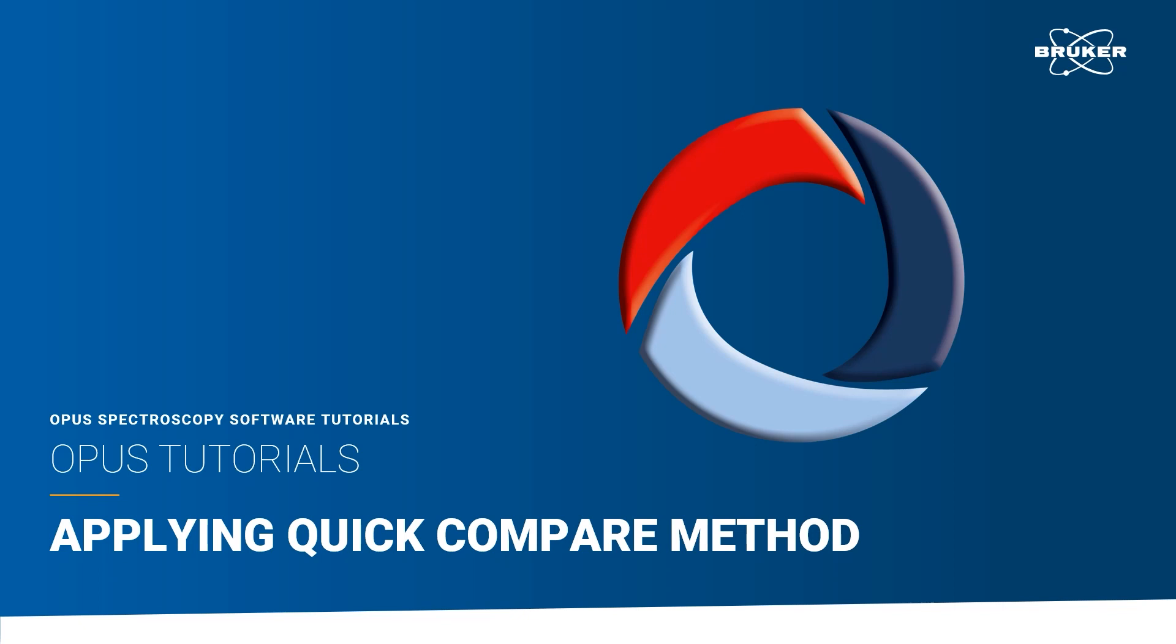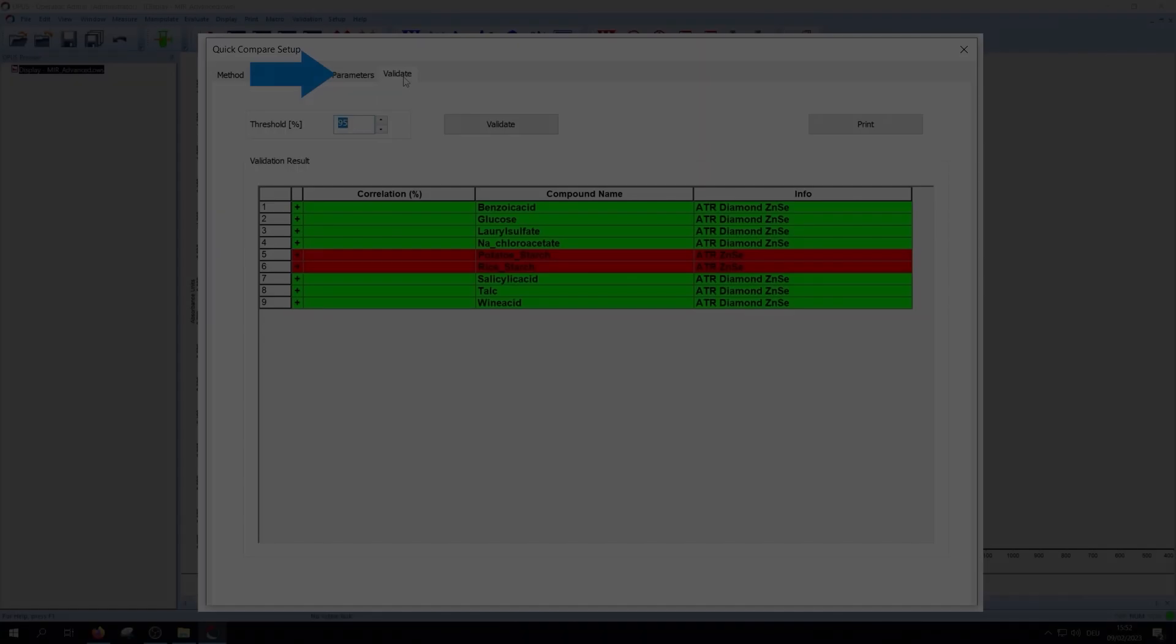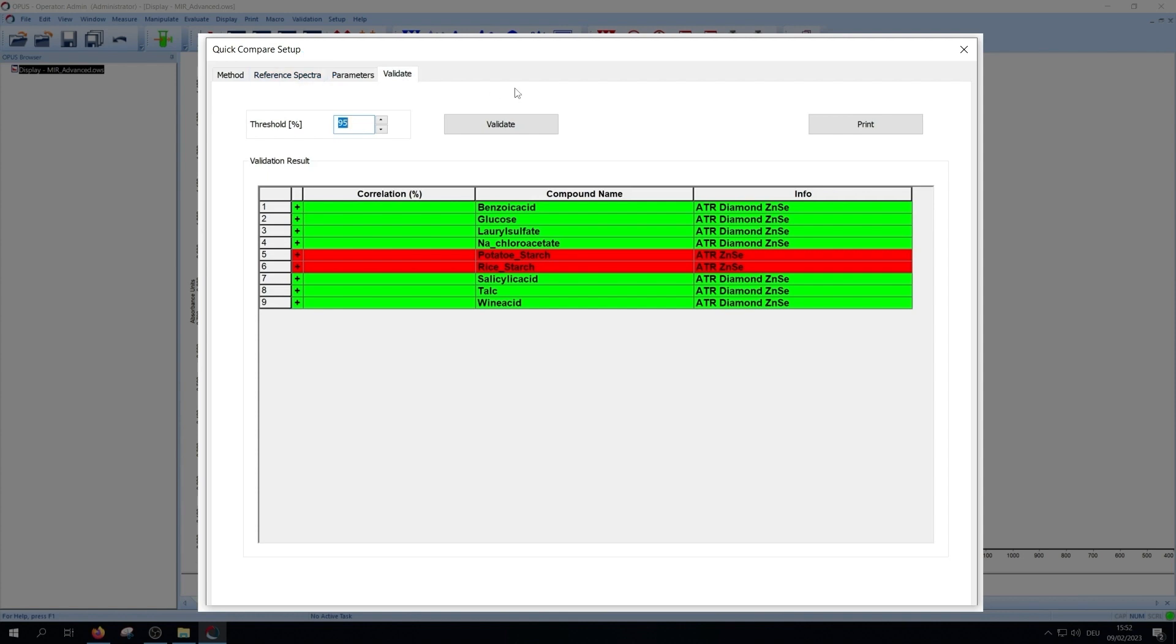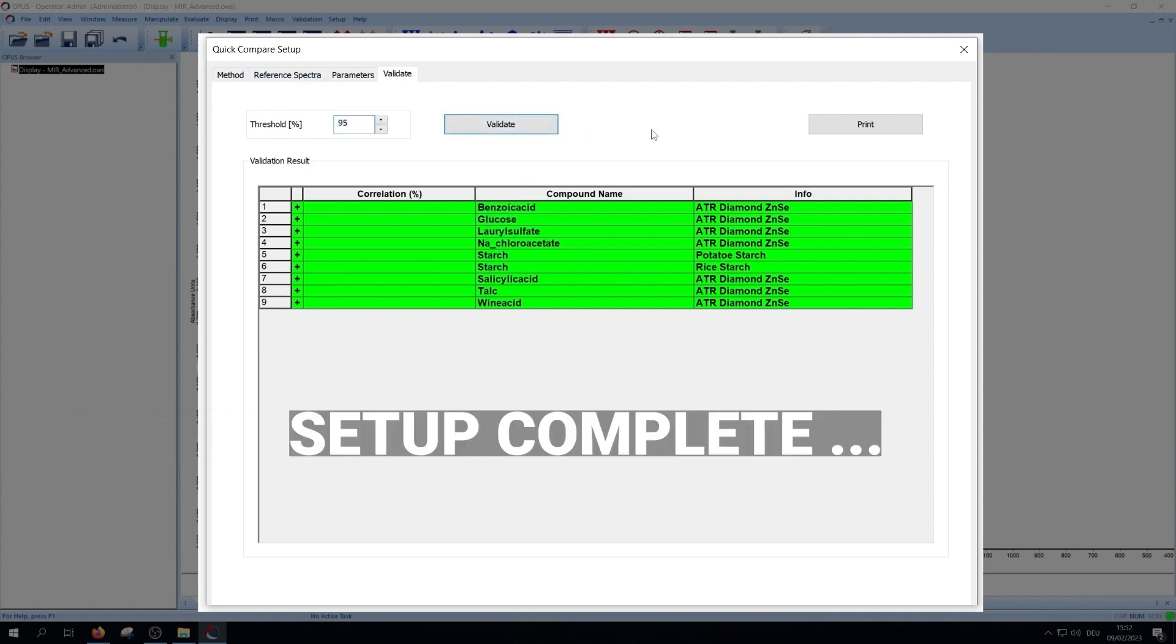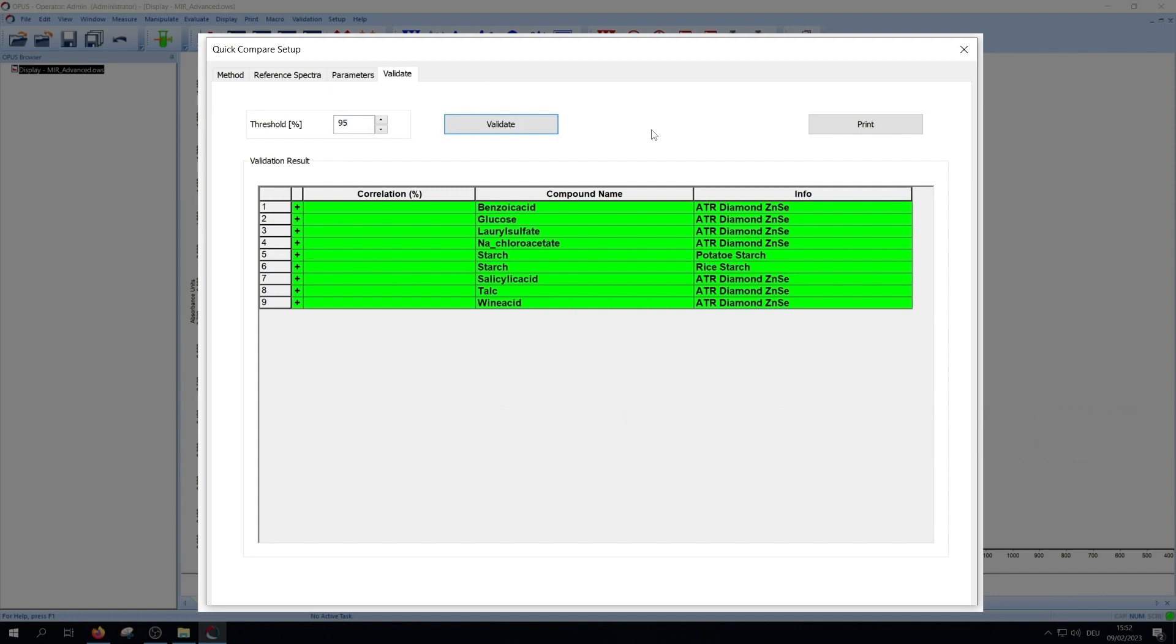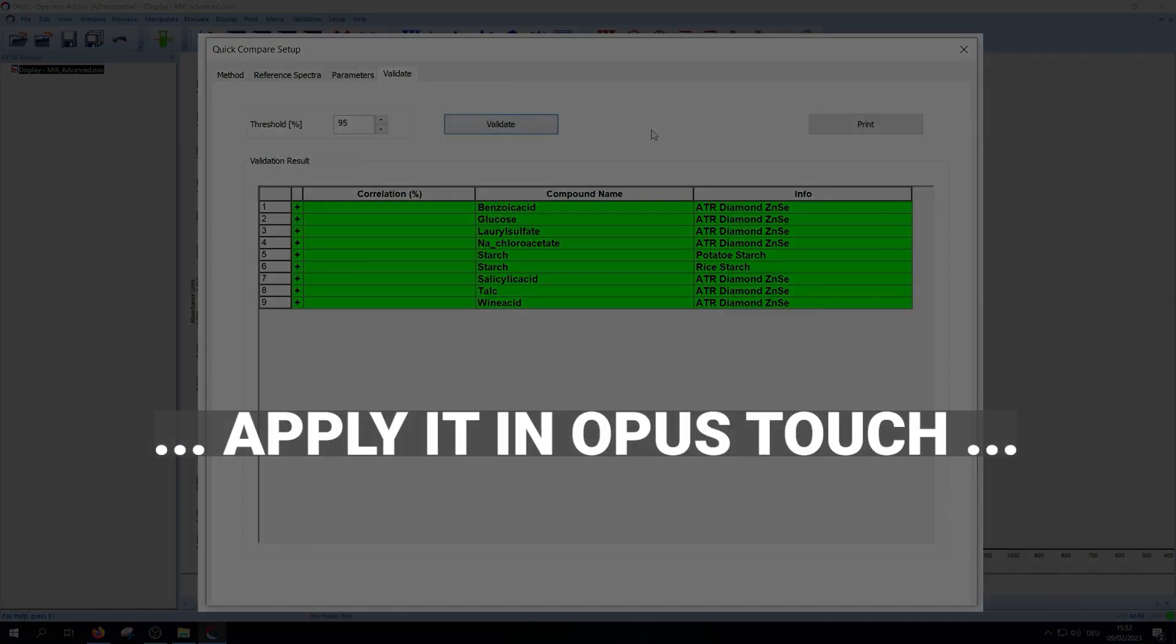Hello and welcome to the quick compare tutorial. After you made all settings in the quick compare setup, you can use the quick compare function. For more information about it, look at our quick compare setup tutorial. We will use the setup of that video.